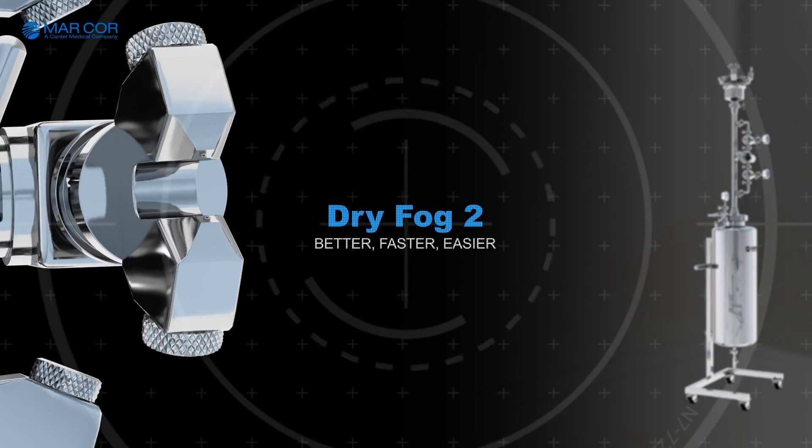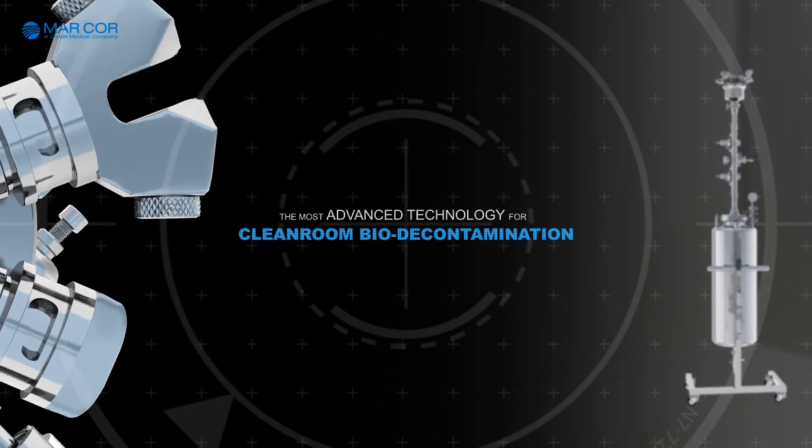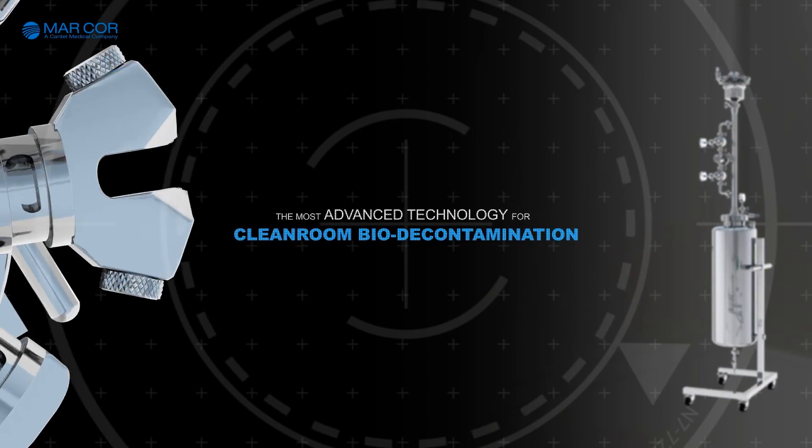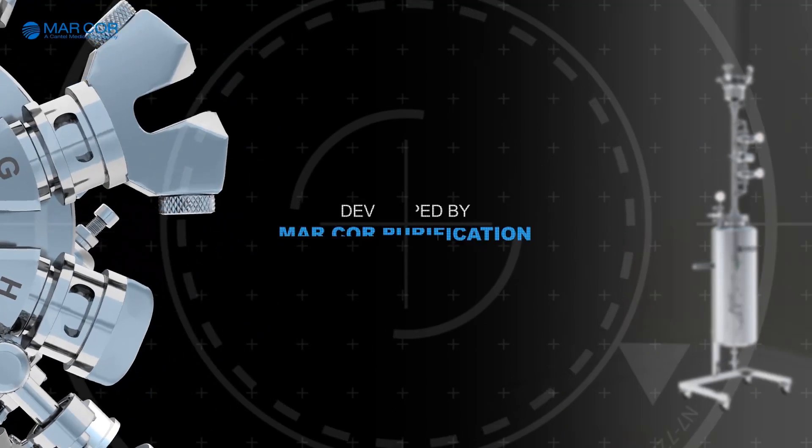Dry Fog 2. Better, faster and easier to use. Dry Fog 2 — the most advanced technology for clean room bio decontamination from Markor Purification.